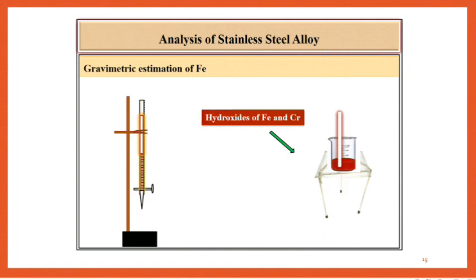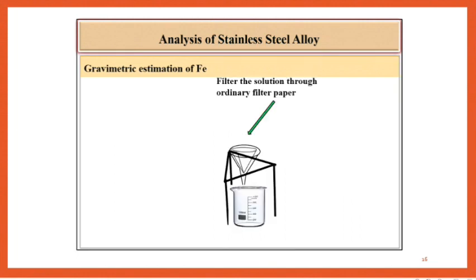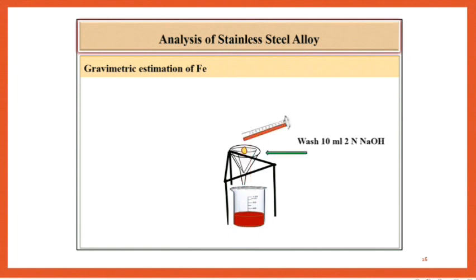Filter the precipitate. The precipitate consists of hydroxides of both Fe and Cr. Allow it to settle down, then filter through ordinary filter paper. Pierce the filter paper and wash with 10 ml 2 normal NaOH and 10 ml 3% H2O2.